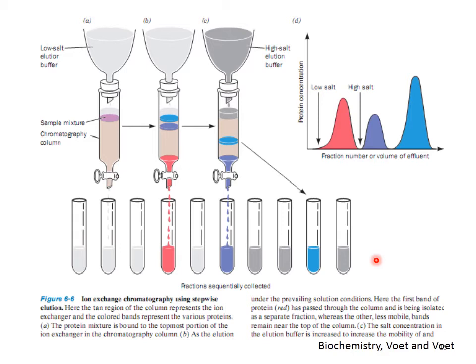This illustration shows the manual mechanism for adding the different salt concentrations to the stationary phase and removal of the proteins from the column. These days, there are automated machines which automatically take up the protein solution from a sample reservoir, take the buffers from the buffer reservoir, mix the salt solution with the buffer, and automatically inject those salt concentrations into the column.